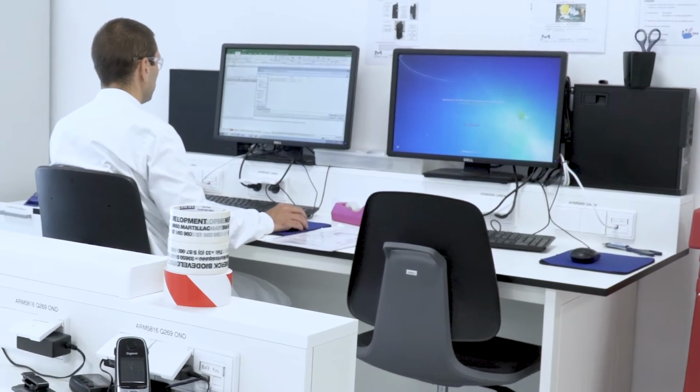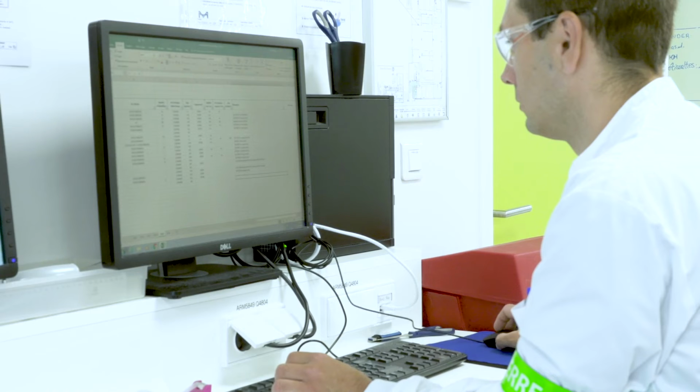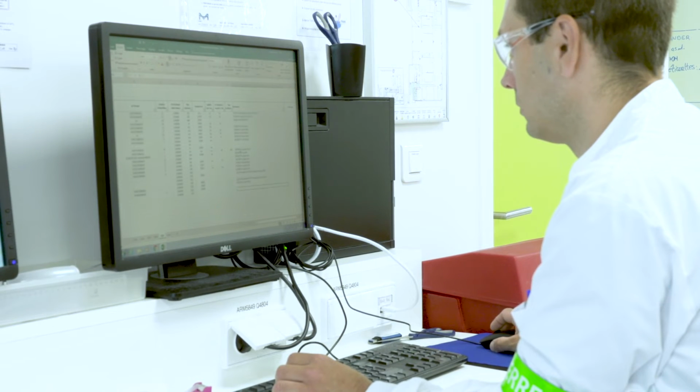We used design of experiments, or DOE, to identify the optimal conditions for precipitation with a focus on 2 key parameters: the concentration of caprylic acid and temperature. DOE enabled us to reduce the number of experiments required to evaluate these parameters, which was crucial as we had a limited number of cell bioreactors available for the study.